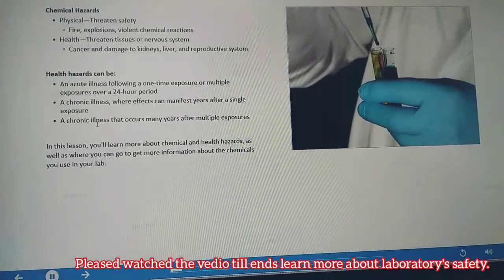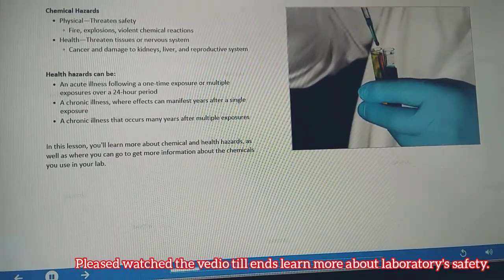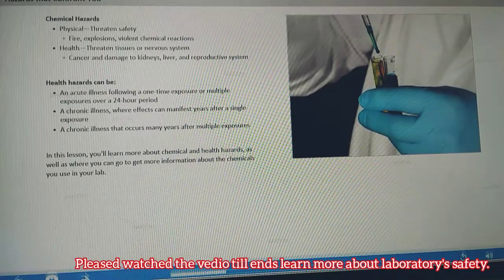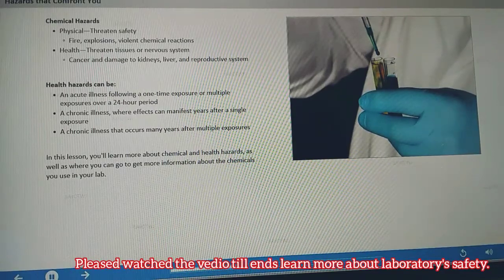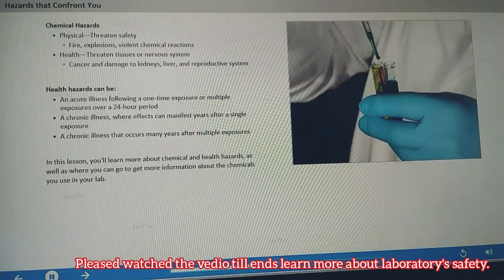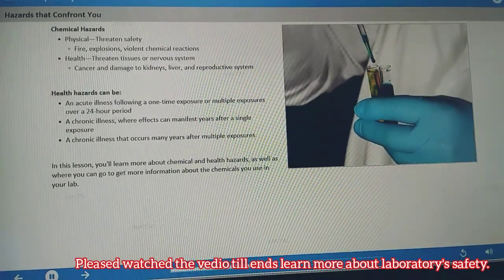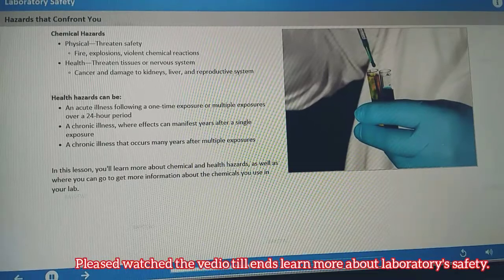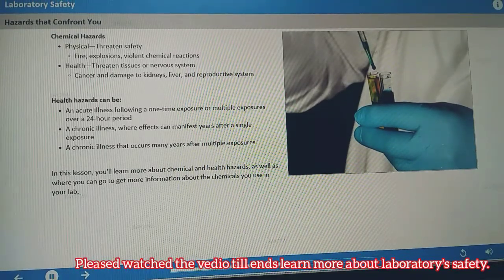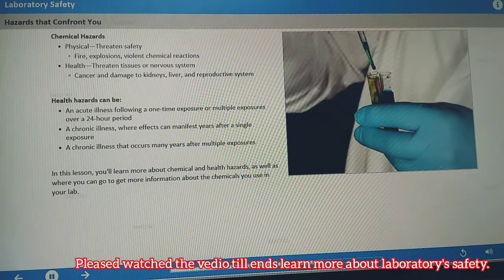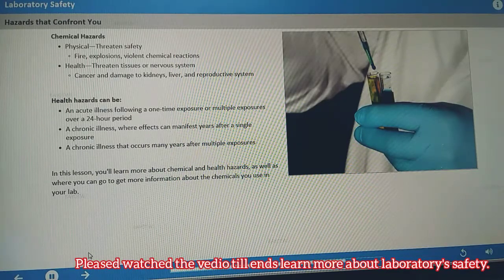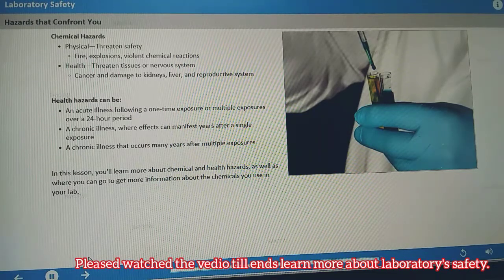Chemicals in non-production laboratories present both physical and health hazards to workers. Physical hazards threaten your safety. Health hazards are sometimes more difficult to identify immediately. Health hazards fall into two broad categories: acute and chronic. In this lesson, you'll learn more about chemical and health hazards, as well as where you can go to get more information about the chemicals you use in your lab.